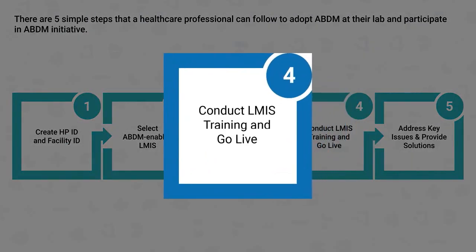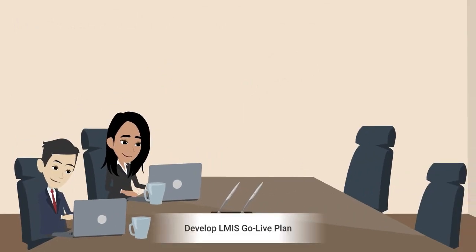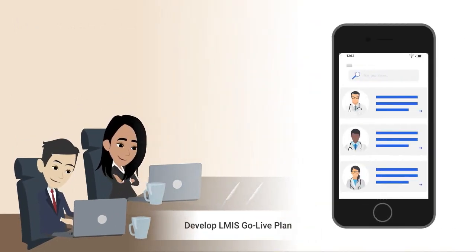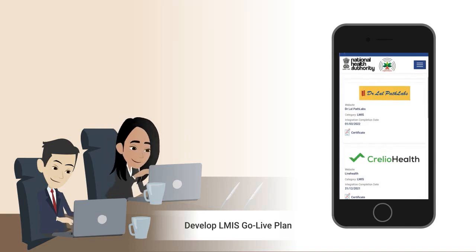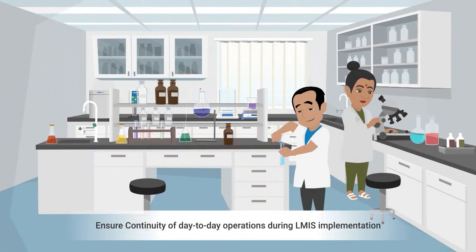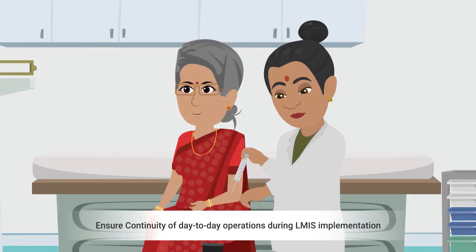Conduct LMIS training and go live. The lab LMIS team needs to develop an LMIS go live plan with the help of an LMIS application vendor. The plan should ensure continuity of day-to-day operations and care for all patients during implementation.